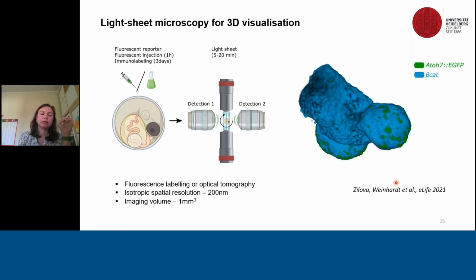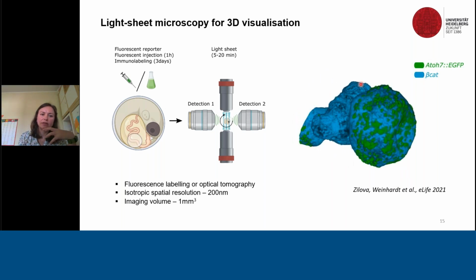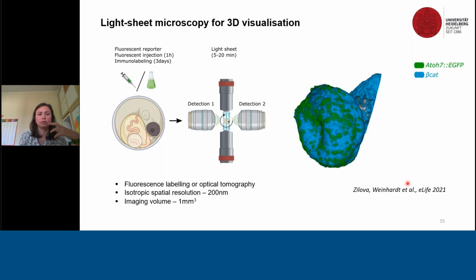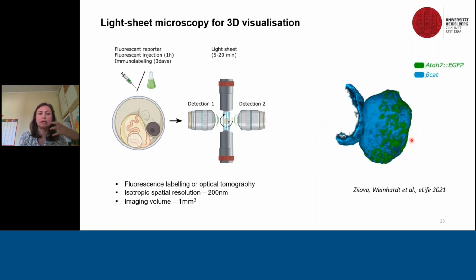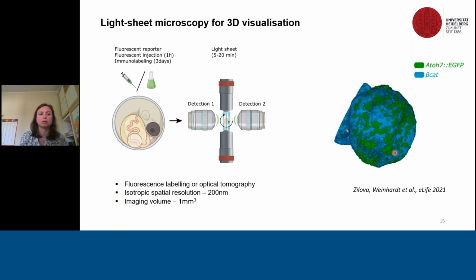What is interesting, however, is that often what one sees in fluorescence microscopy gives an impression of a complete tissue, so to speak, and one sees those individual cells, but there is a lot of information around which is not present there. And that's because fluorescence microscopy relies on the targeting.